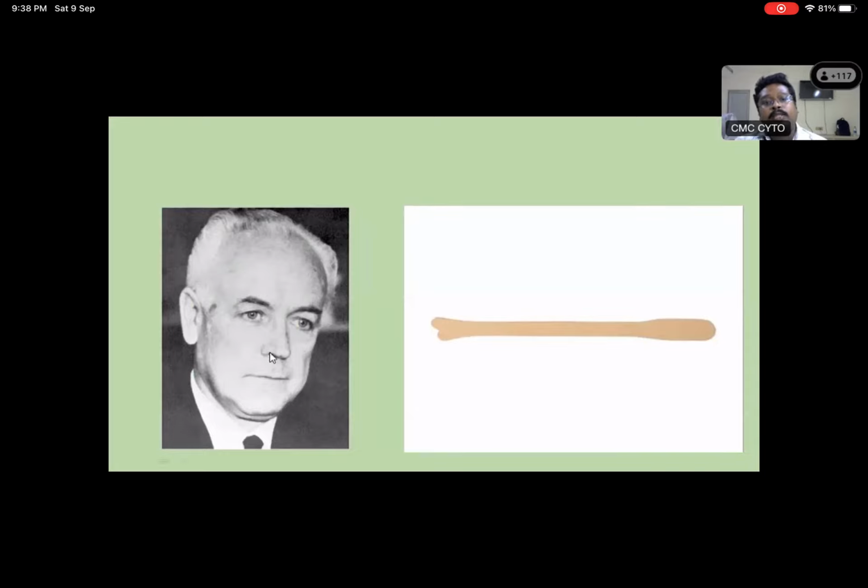Any idea who this person is? What is this stick-like thing? Spatula. So what is it called? Cervical spatula.